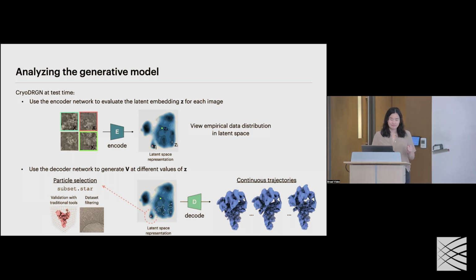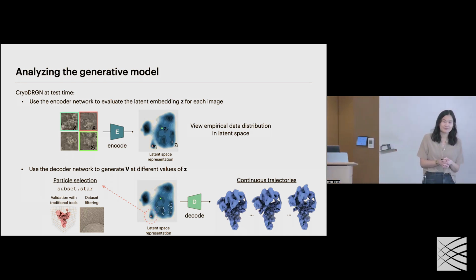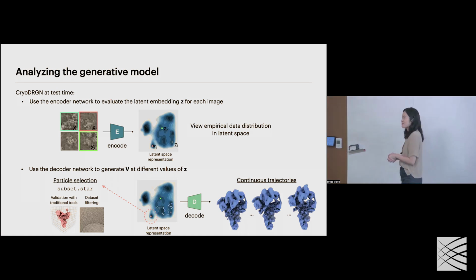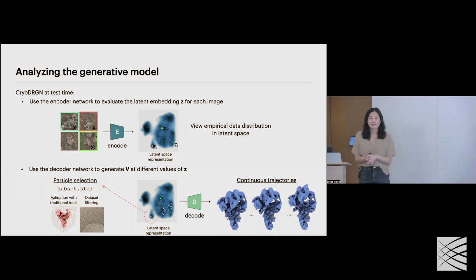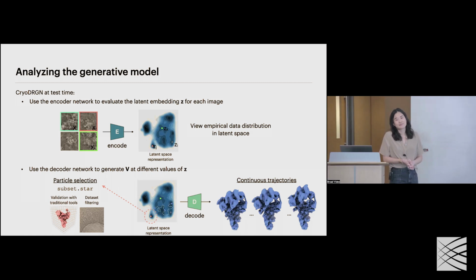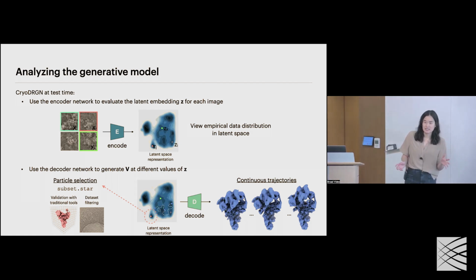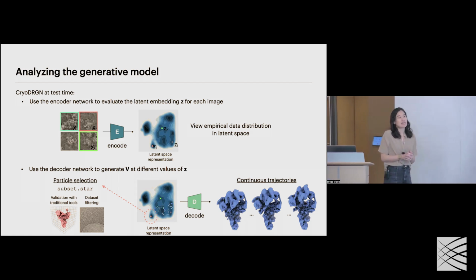Quick question. So you mentioned that this approach uses none or very few assumptions. So what are the assumptions it uses, and how does it compare with the assumptions made in the traditional approach where you assume it's sampled from a normal distribution? Yeah, I guess the main assumption is that the distribution of structures can be represented in some lower-dimensional space. But we don't make any more strict assumptions about what that distribution might look like.